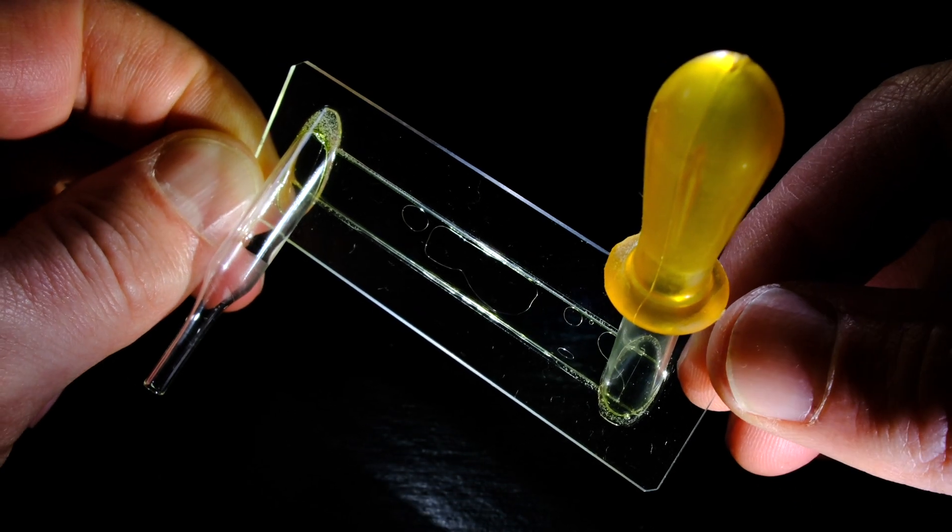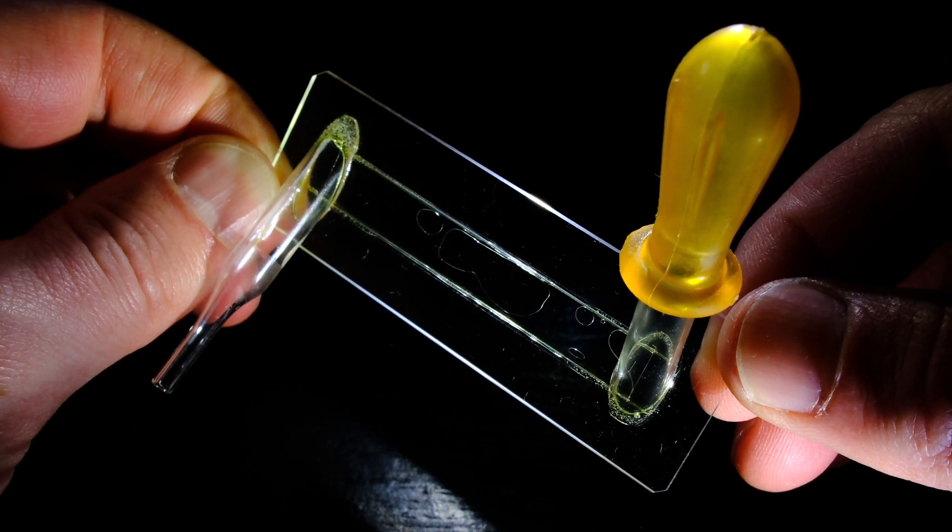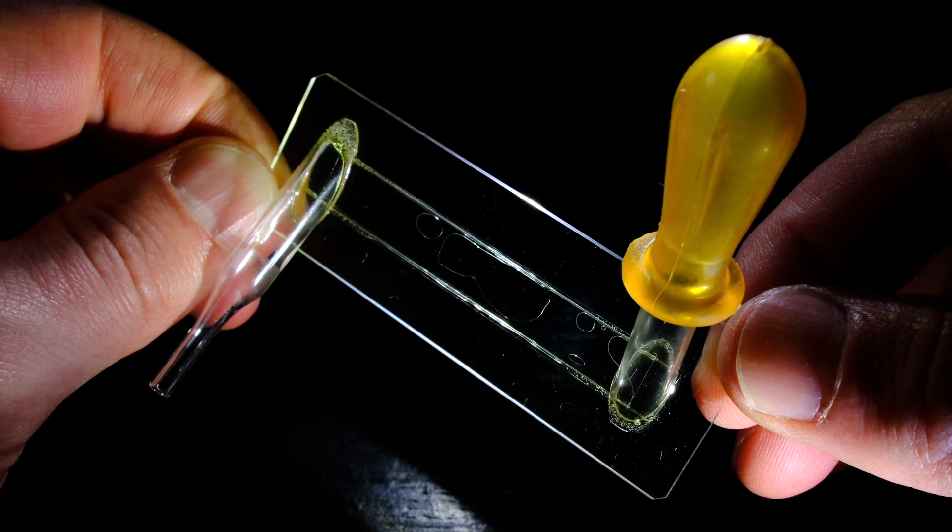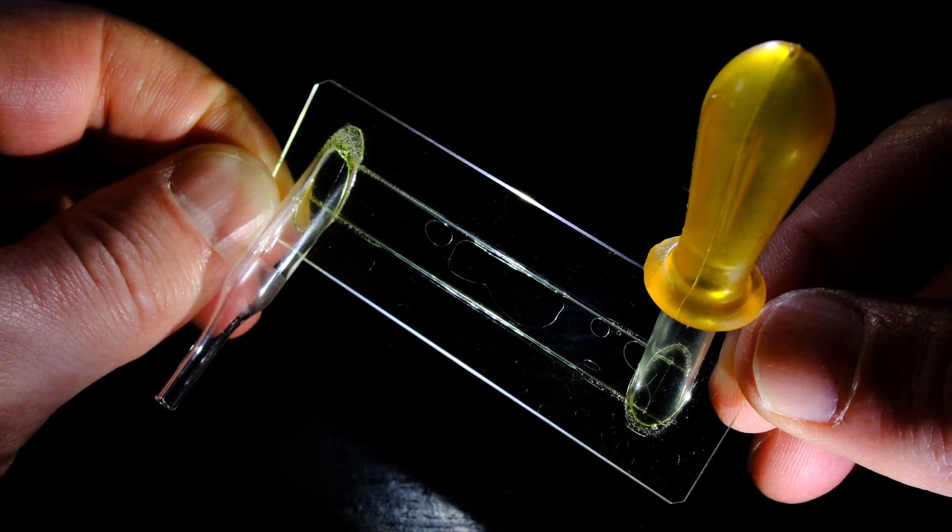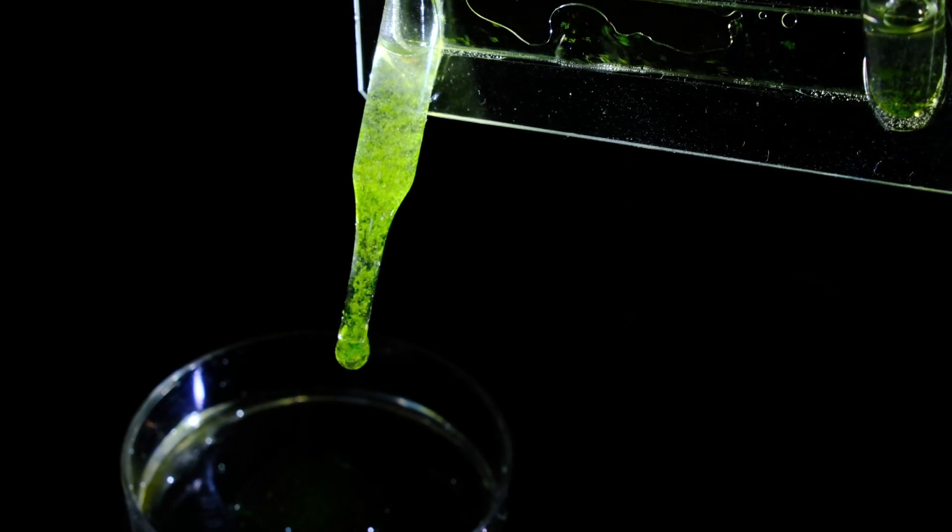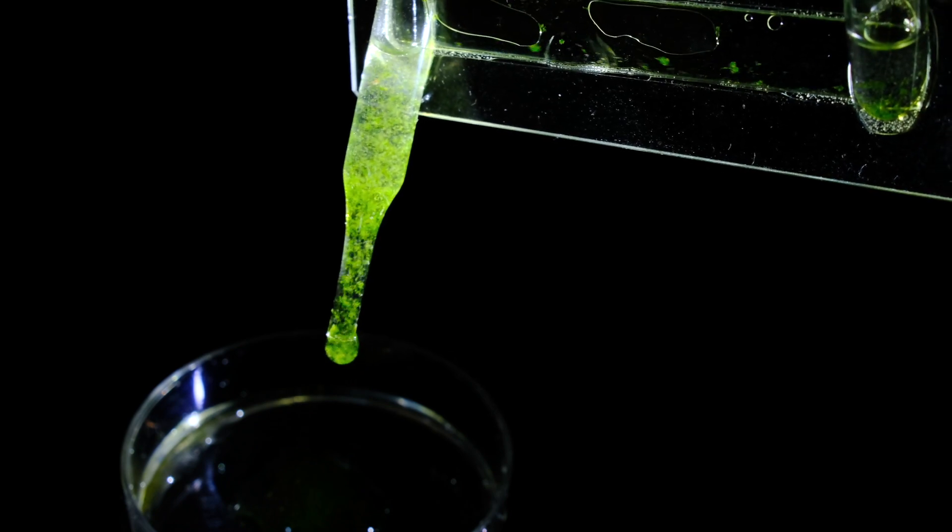The frankenpipette is all three things in one, so you save a lot of time when it comes to checking bigger samples. Its capacity is exactly one milliliter of liquid, which is quite a significant amount when it comes to microscopy.